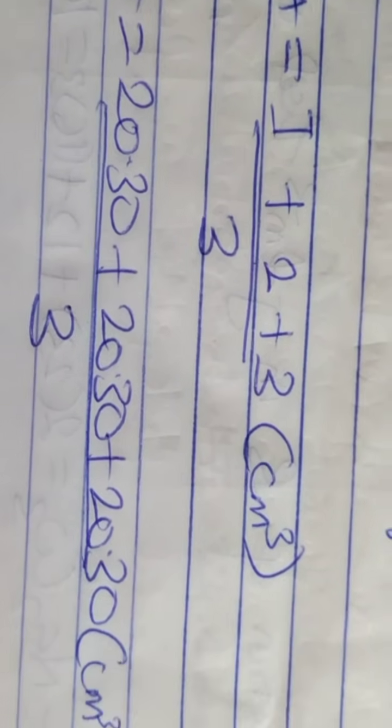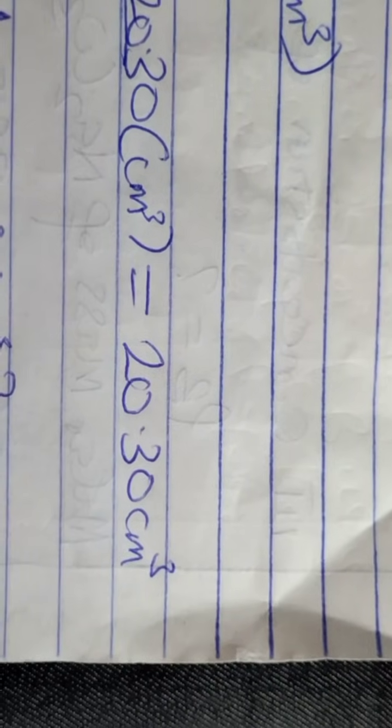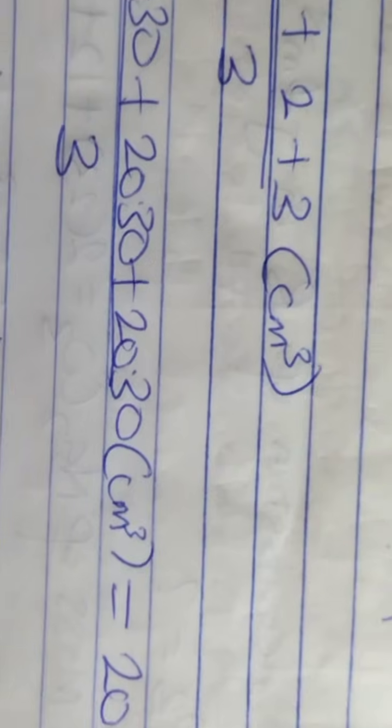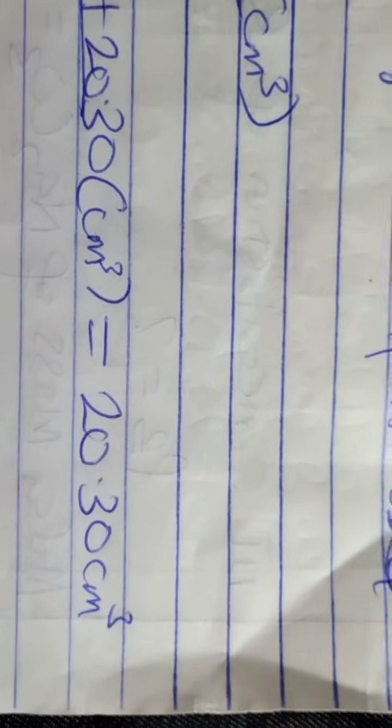So we have 20.30 plus 20.30 plus 20.30 all over 3 in cm cube. And that gives us 20.30 cm cube. Everything from the table to your VA, everything must be recorded to two decimal places. So that is our working endpoint, 20.30 cm cube.